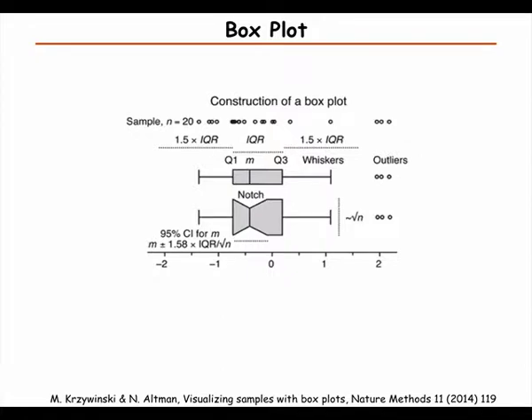So another way to display data that's very powerful is a box plot. And I don't know, you probably have used that already quite a bit. But the idea is that in a compact way, we can show quite a lot of information.